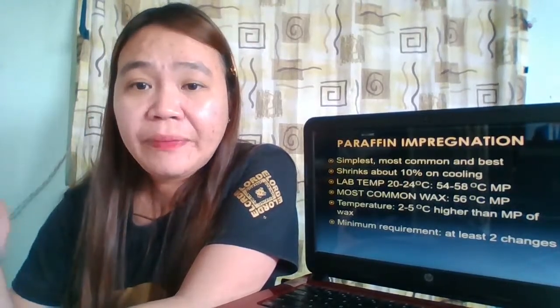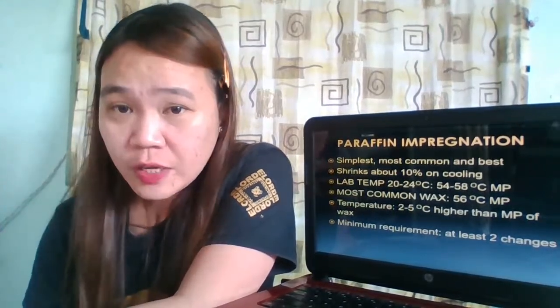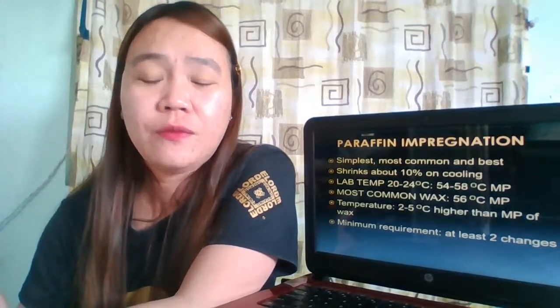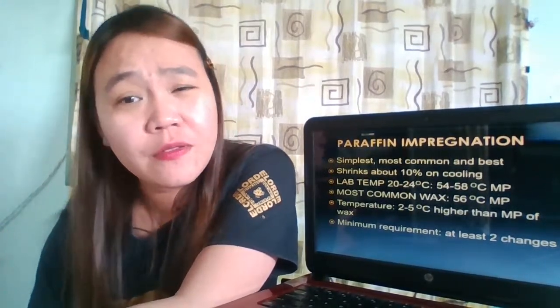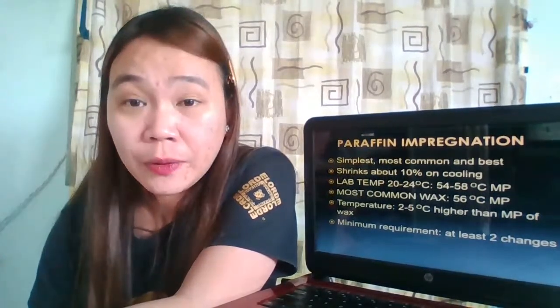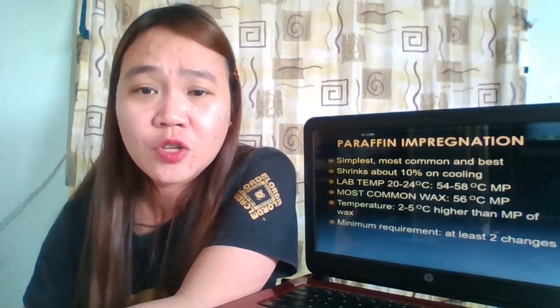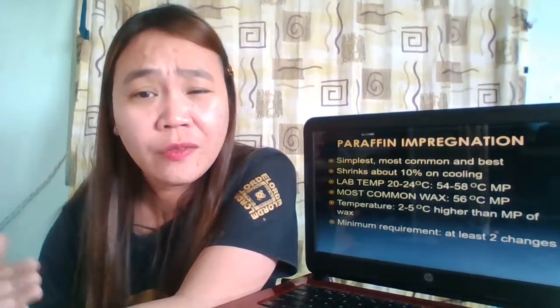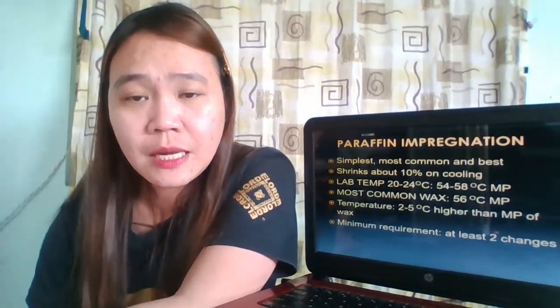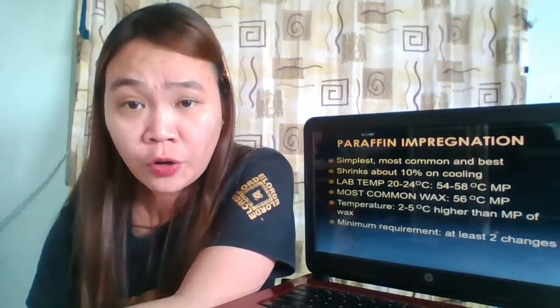What is a tissue section? A tissue section is a very thin slice of your tissue sample. May I emphasize thin, because what we want during sectioning in general is to have a thin section.